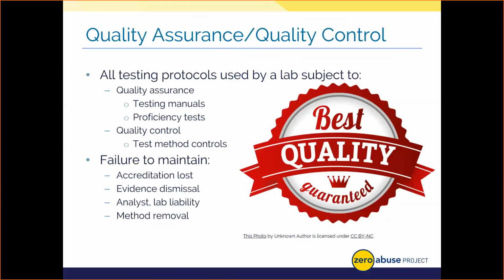Many labs actually publish these online for you to look at. And it shows, right, how to proceed with testing a given item. Now, a good QA program or policy also has analysts performing proficiency tests, typically quarterly in most cases, to make sure they're working at the level they need to be a great analyst in that lab.